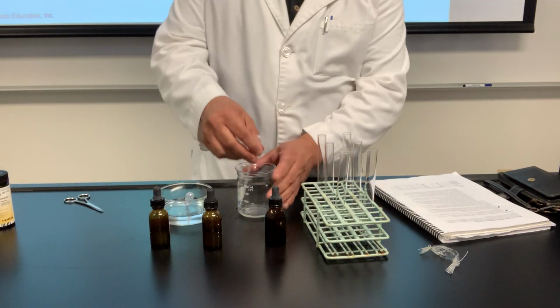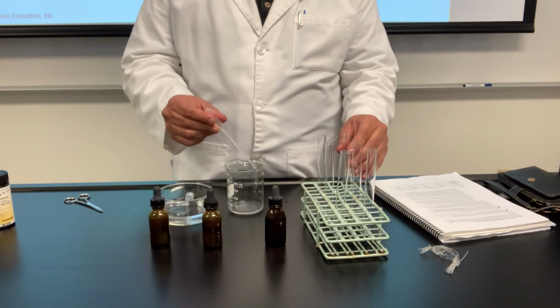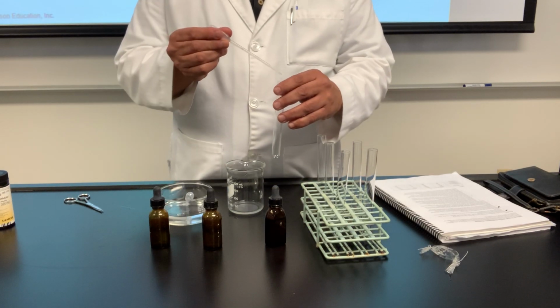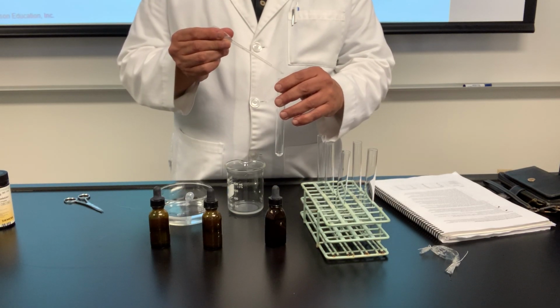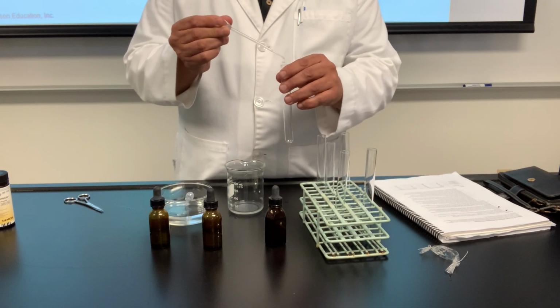And the lab manual is asking you to take this solution. Again, I'm only demoing it. You're not doing it. I'm just demoing it. And do like 15 drops or so, or 10 drops. Something like that. You don't need exact numbers.